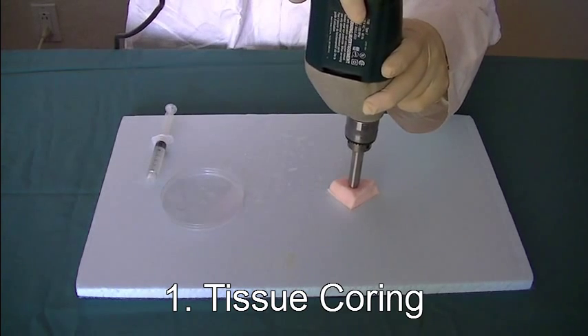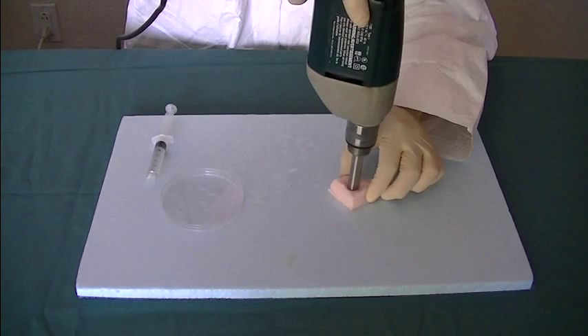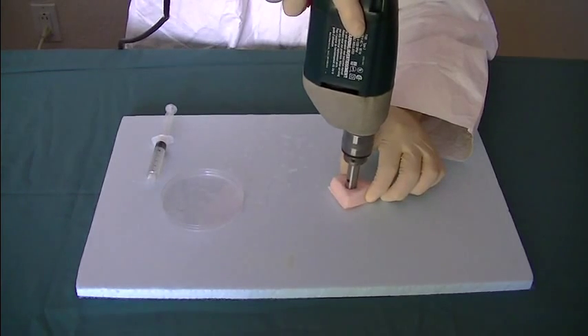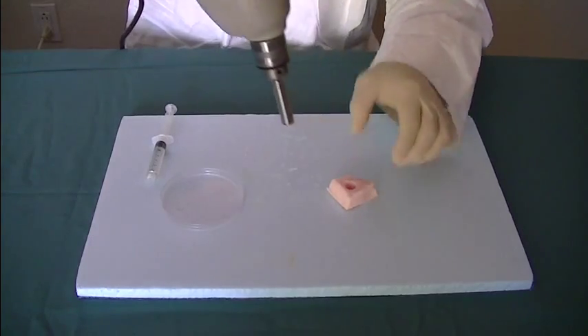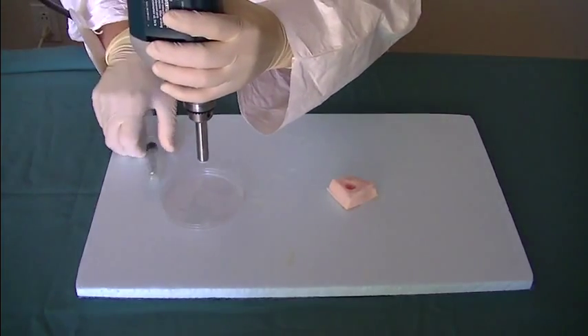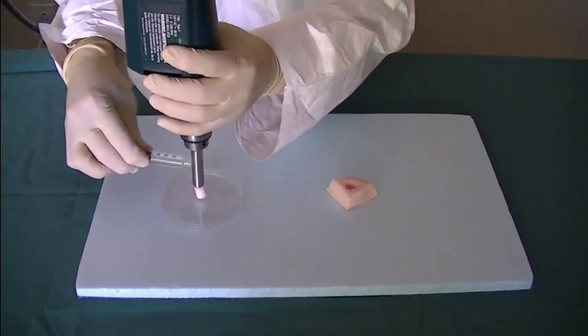Tissue Coring. Cut tissue core with coring tools. Flush tissue core out.